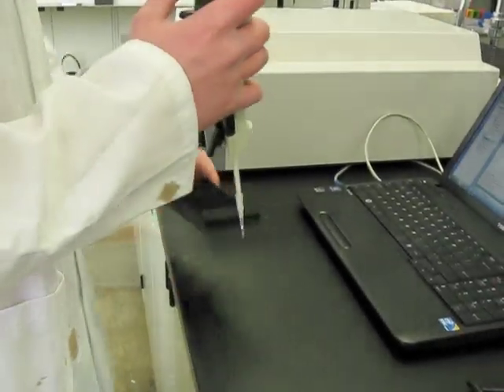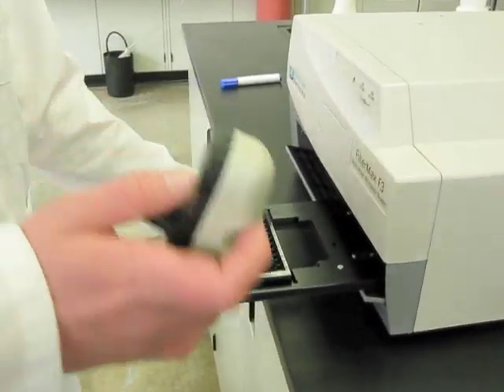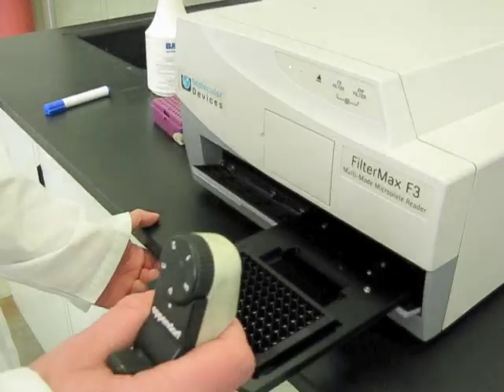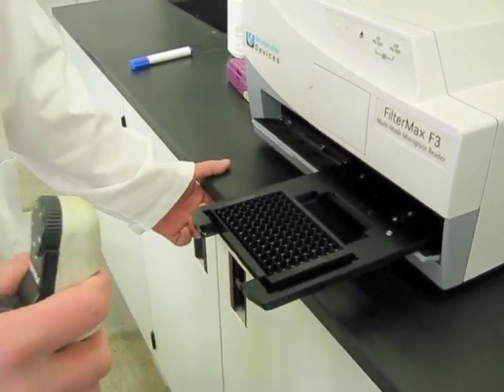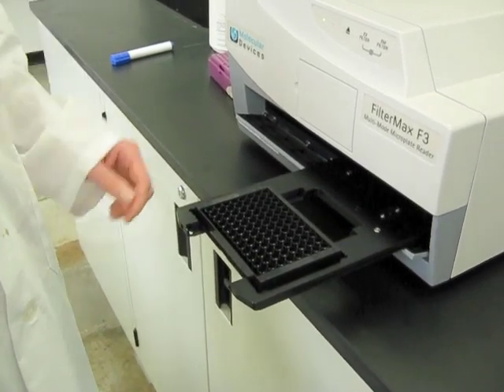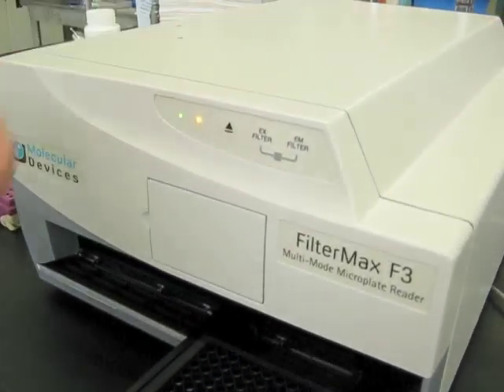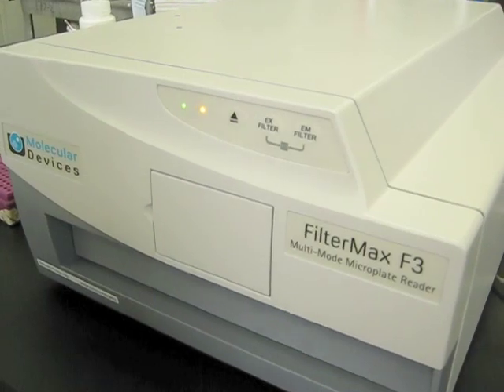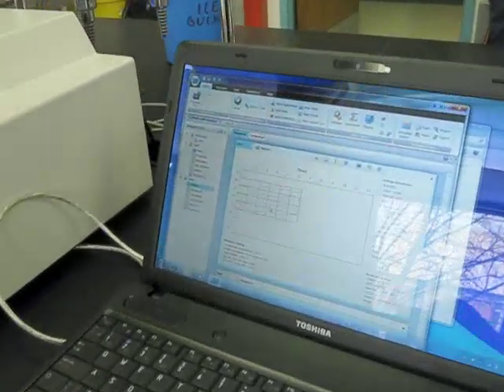We're going to add 160 microliters of the thiol dilution into each well, in duplicate. We're going to place it into the plate reader, and quickly, we're going to add 40 microliters of the di-eosin glutathione disulfide solution into each well. We're going to close the plate reader quickly and press read.